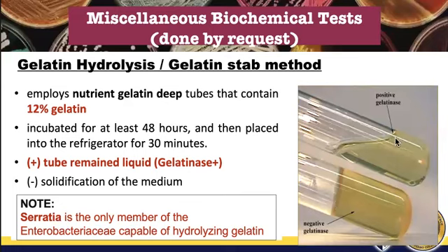Pero kung it would start to tilt like this after a minute, positive siya for gelatinase enzyme. Now, for this test, it is known that only Serratia, no, ang nag-hydrolyze ng gelatin. Okay?